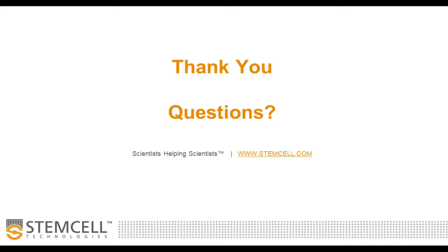For humans, it takes 14 days, and then you get images like you saw on the slide deck. And then you have to score those. You have to go colony by colony. So on an inverted microscope, of course, you need training so that you get used to doing that. It usually takes a couple of months. And it also takes about 5 to 7 minutes a plate in a well, where something like automated can be done in a minute. Anyway, that was a long answer to a short question.